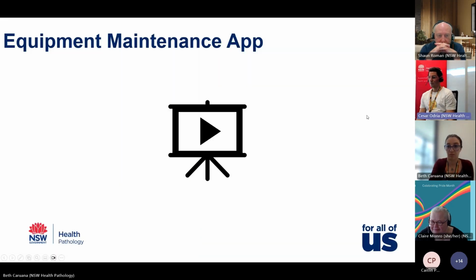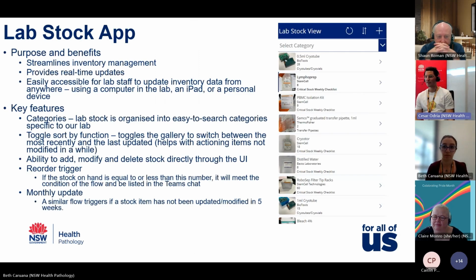Cool. Moving on, we have the LabStock app. So the purpose and benefits of this app is that it streamlines inventory management, provides real-time updates, and is easily accessible for lab staff to update inventory data from anywhere. So whether you're in the lab using the computer, the iPad, or even your personal phone, it all works the same.